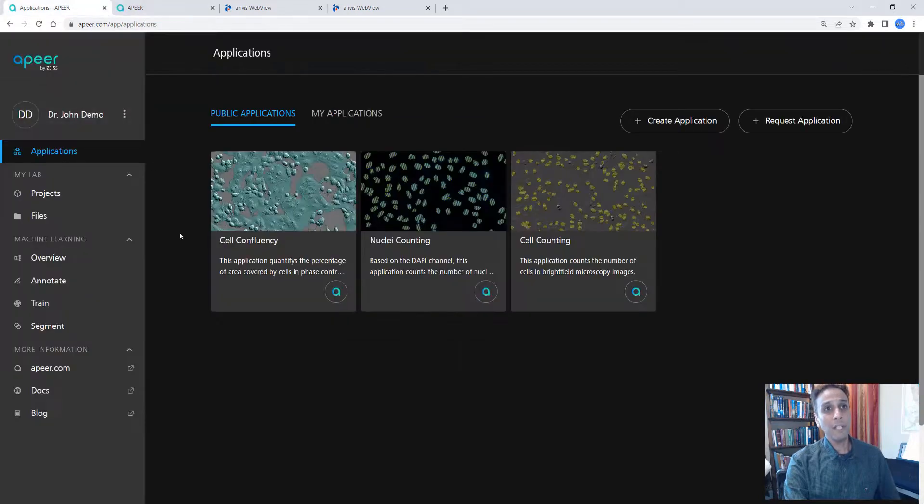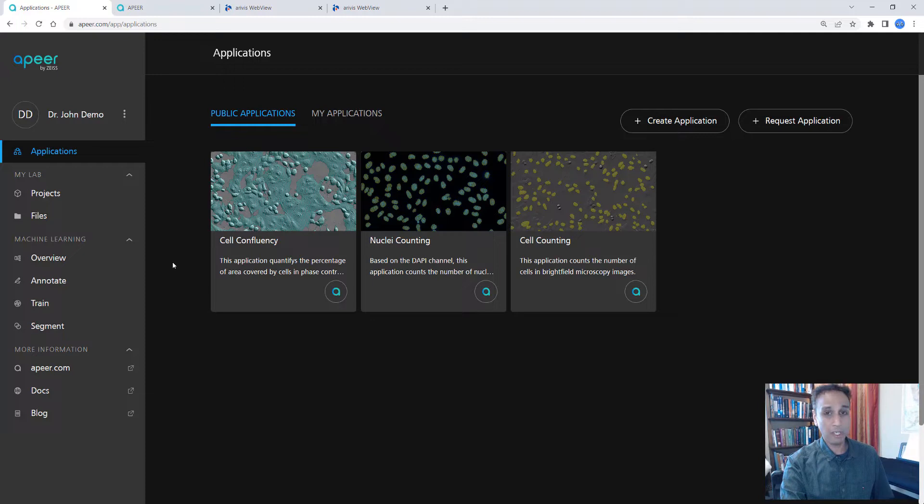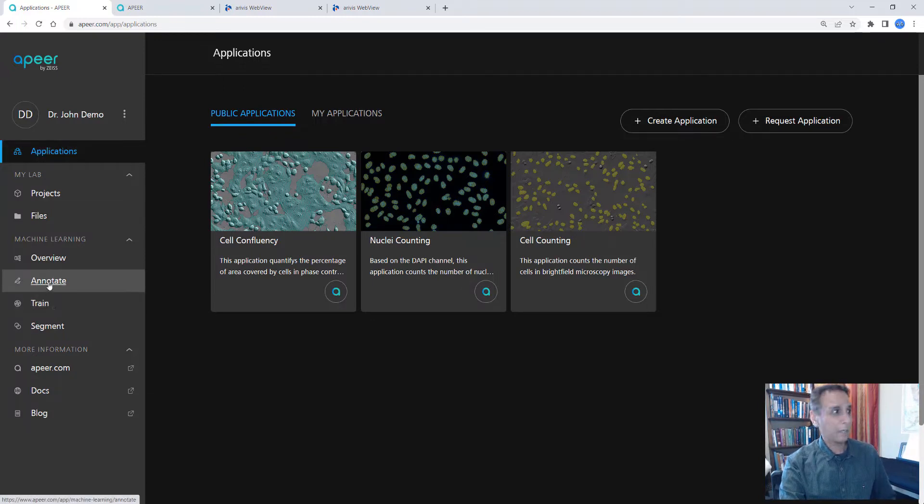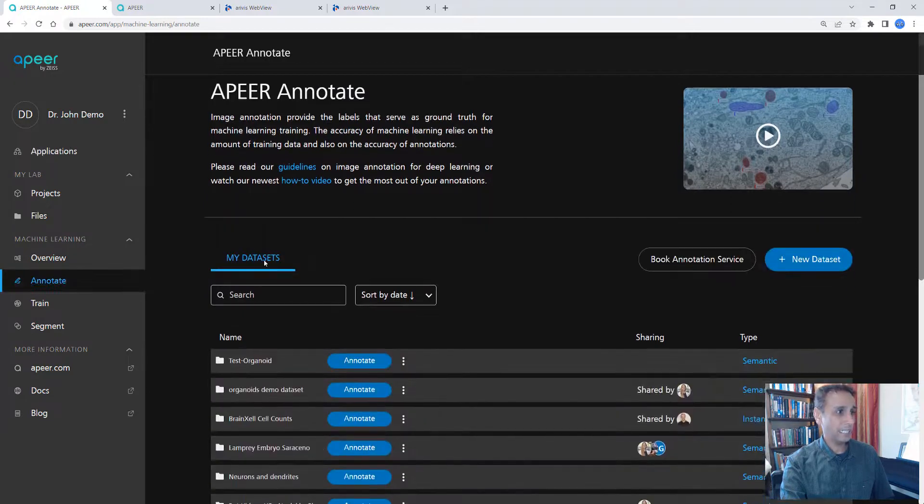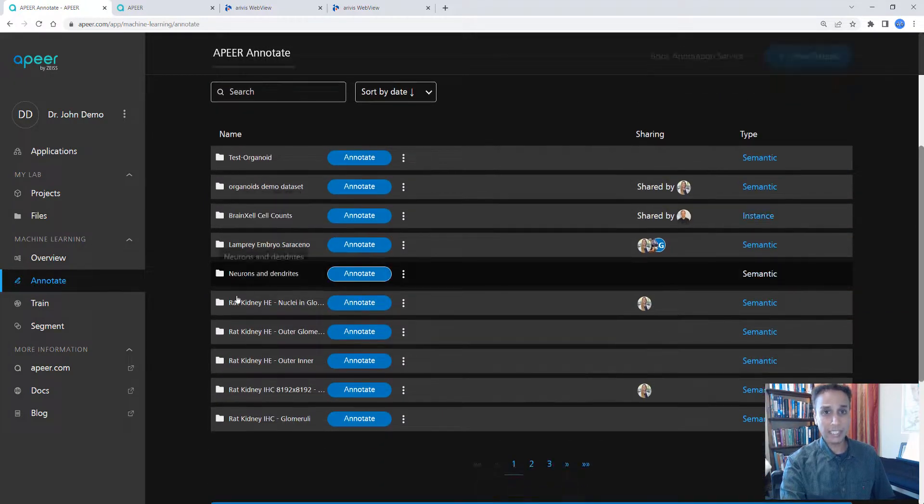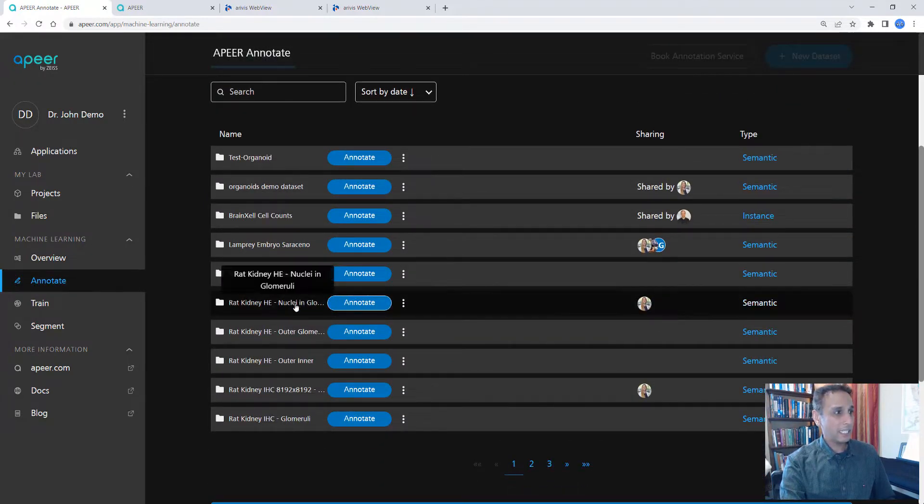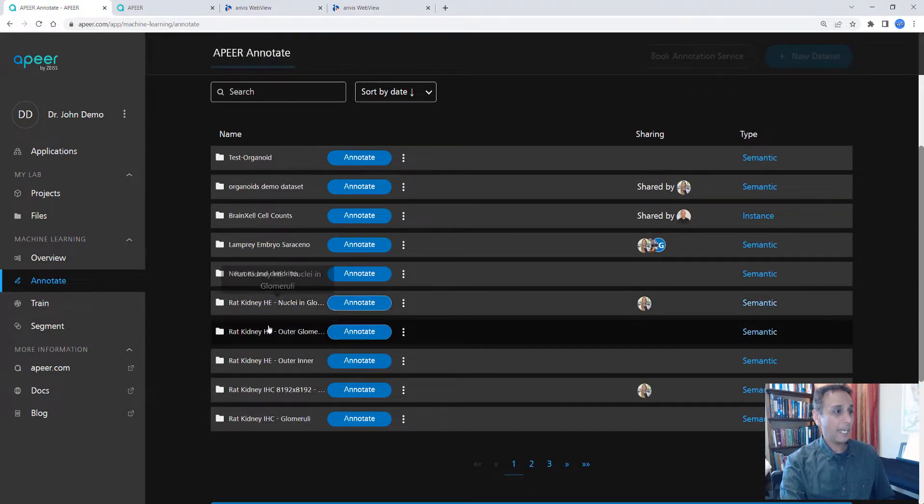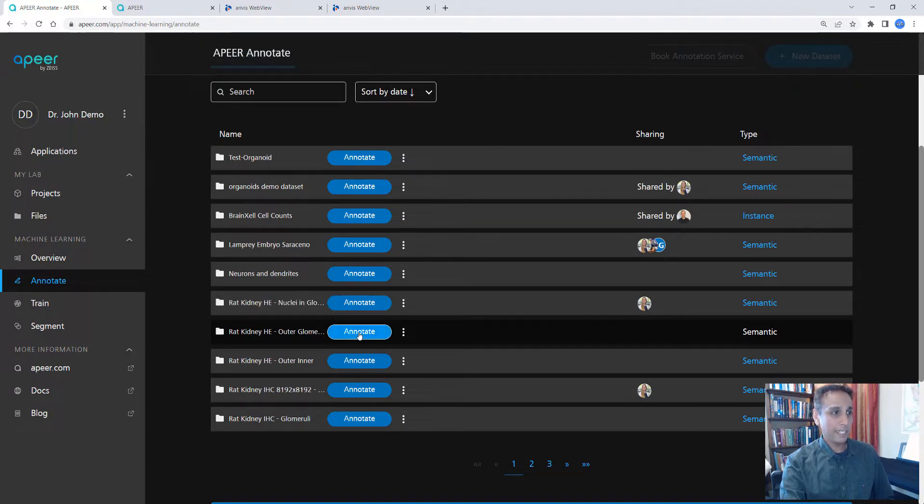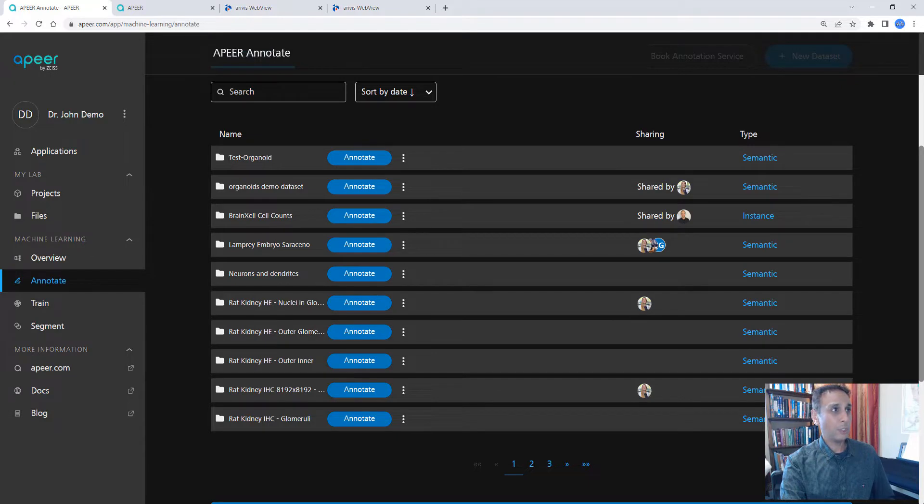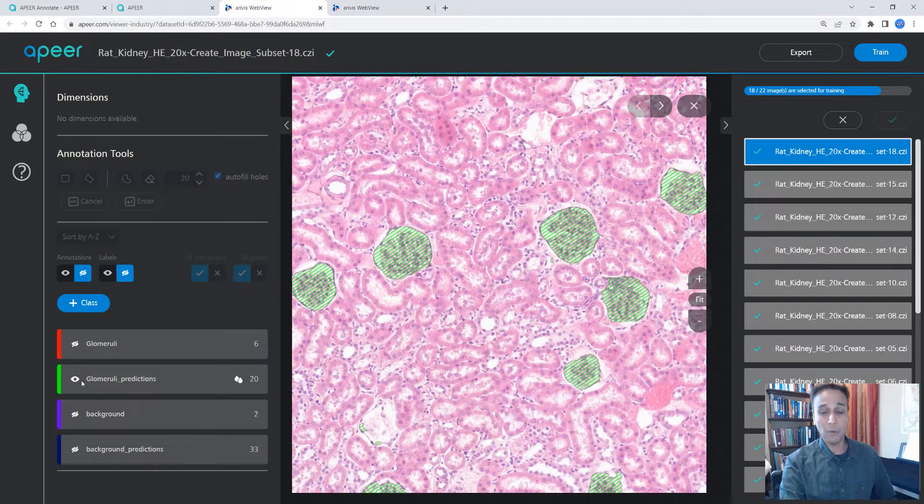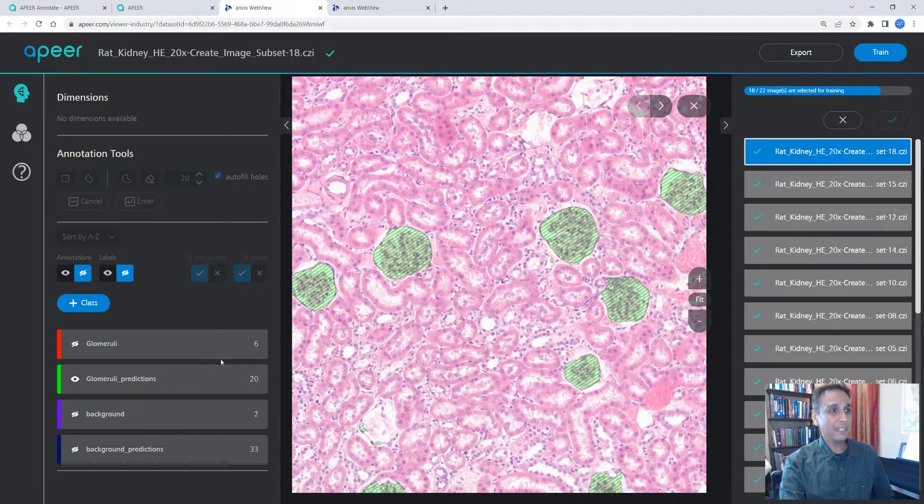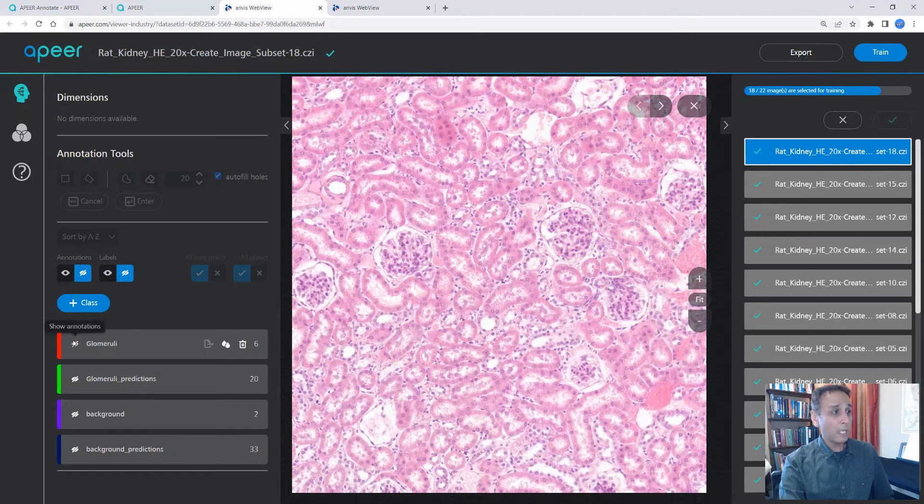Now if you already have a login account, go ahead and hit login. You'll see my applications part, but this is not what we're going to talk about. We're going to talk about how to train your model under annotate. Let's go ahead and load a rat kidney glomeruli dataset. I'm going to click annotate. It's going to open that in the web viewer. As you can see, I have already annotated and this is the result.